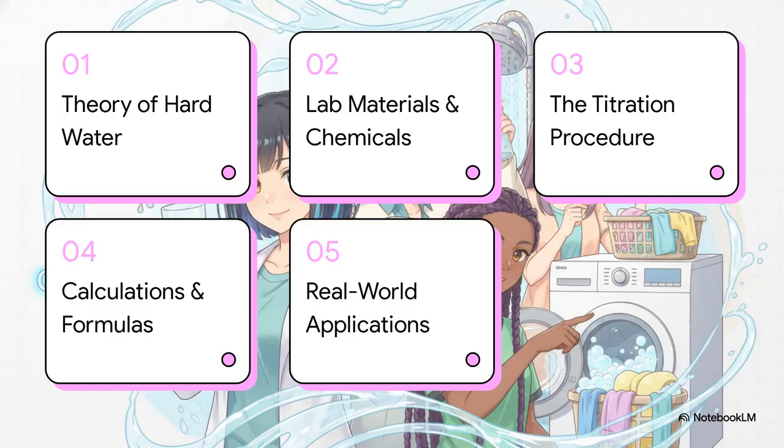Here's our roadmap for today's analysis. 1. The theory of hard water. 2. Lab materials and chemicals. 3. The titration procedure. 4. Calculations and formulas. And 5. Real-world applications. Let's get into it.